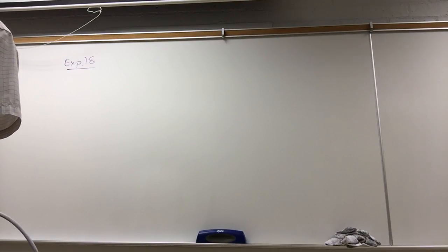So when we look at experiment 18, let's start off with the reactions at the end. So flip to the end. Probably the easiest place to figure out what you're mixing together is not in the data table. In the data table, they kind of summarize it, but in the procedure itself. So can somebody just read the procedure, that is what you're supposed to mix together for the last reaction in experiment 18?